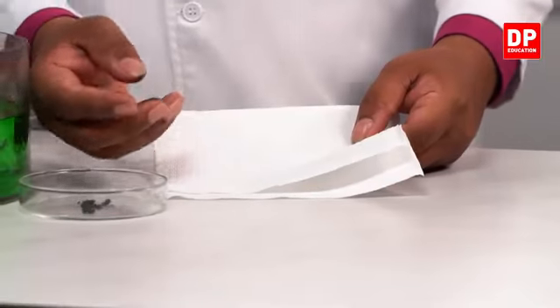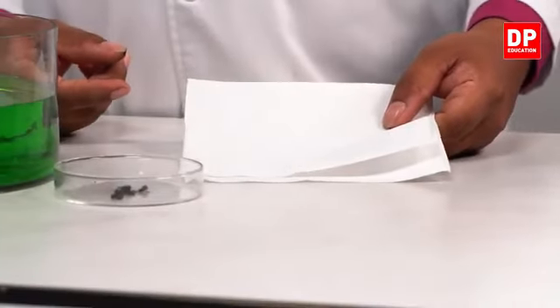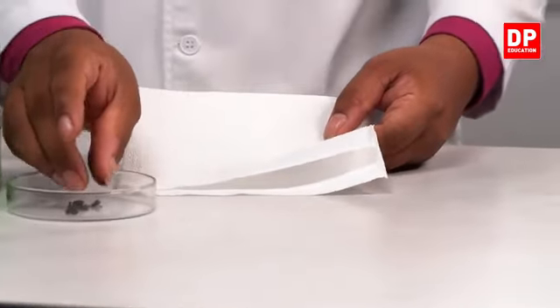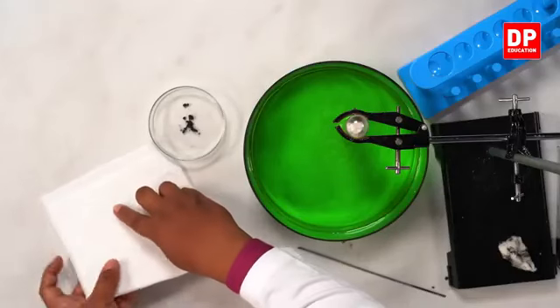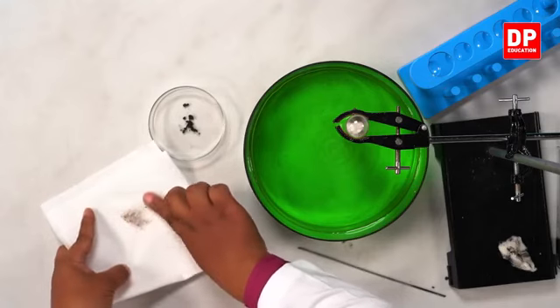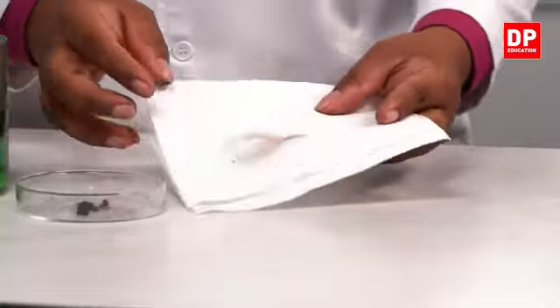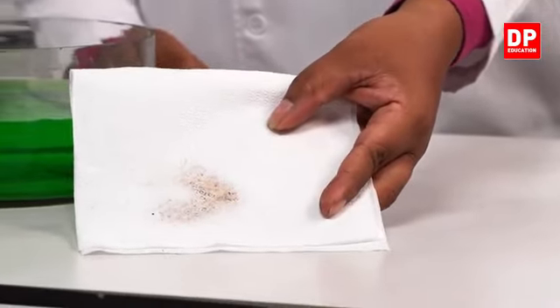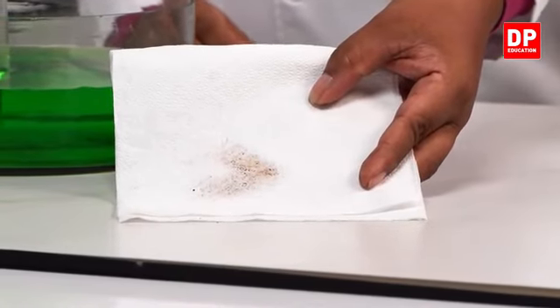Now I'm going to rub this iron powder against this white paper so that you can see a very clear image. I have rubbed it against the paper here. You can see there is a brownish yellow color stain.